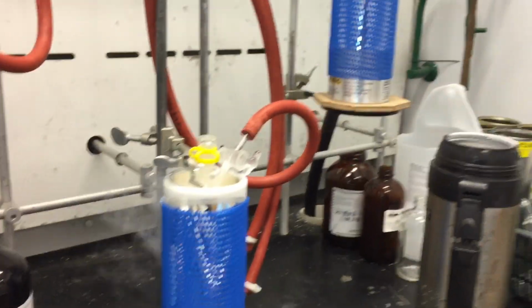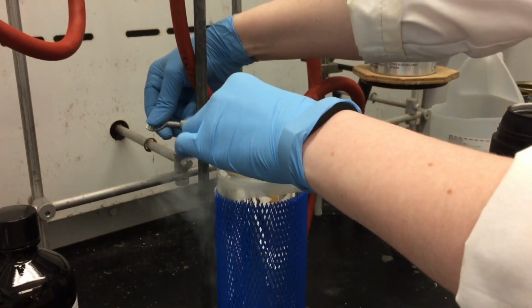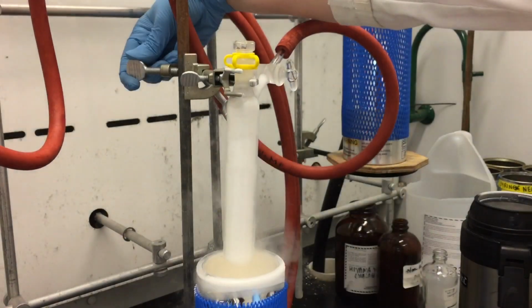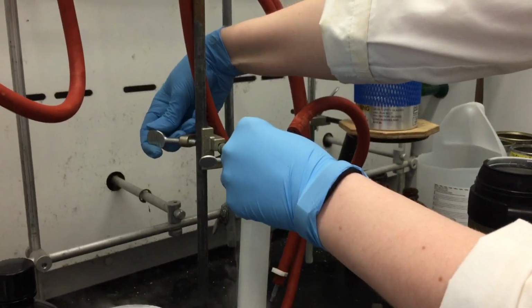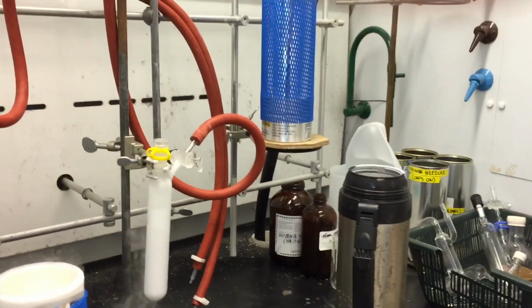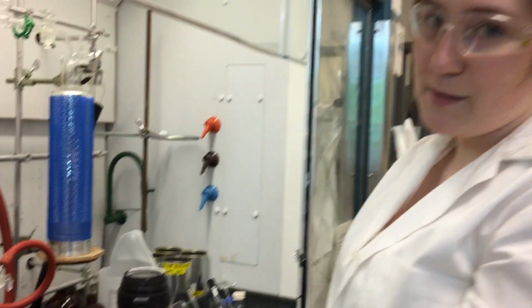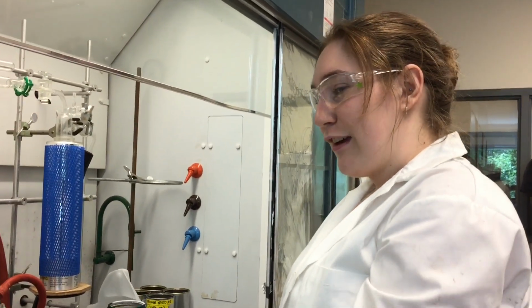Once you finish pumping, you're going to close the tap to the vacuum line. You're going to remove your solvent from the dewar, and then you're going to let it thaw. You want to let it thaw until it comes to room temperature and your solution is liquid again. And then after that has happened, you will want to repeat that 3 times. It's recommended that you repeat the cycle 3 times in order to remove as much as possible from the solution and to get a fairly good oxygen-free solution.